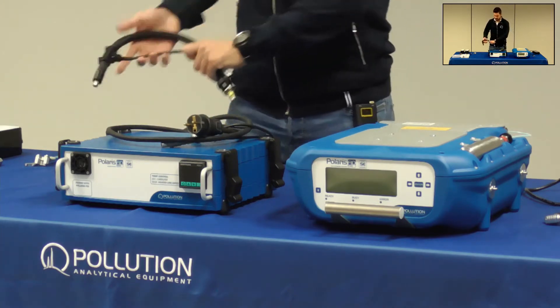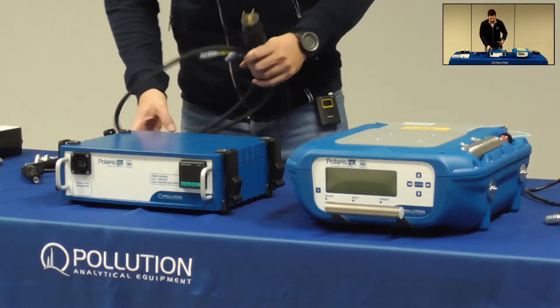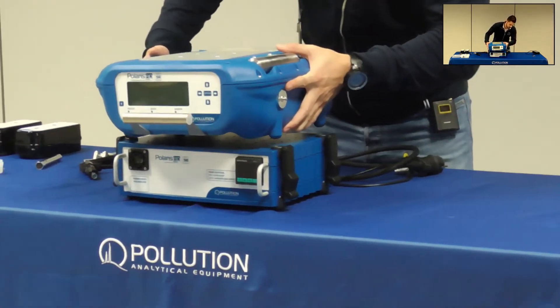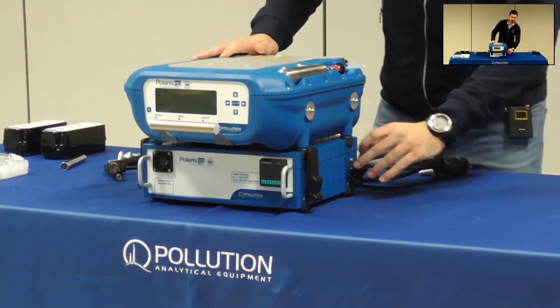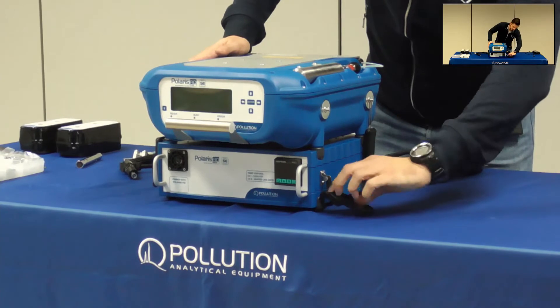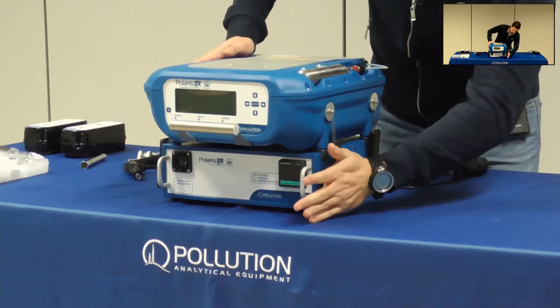To connect the docking station to Polaris you need to perform some simple operations. First place the analyzer on top of the docking station and use the hooks to fix them. Then you need to connect the cables on the back.